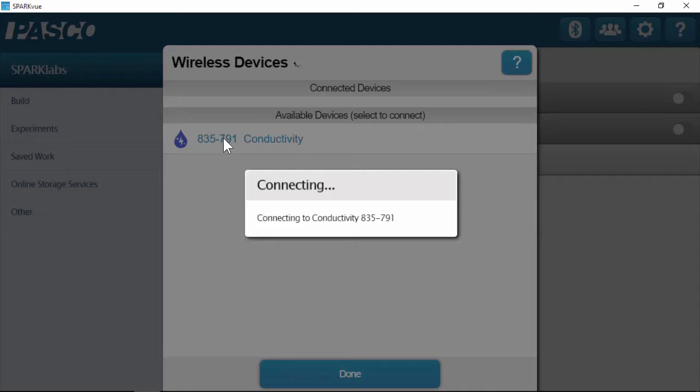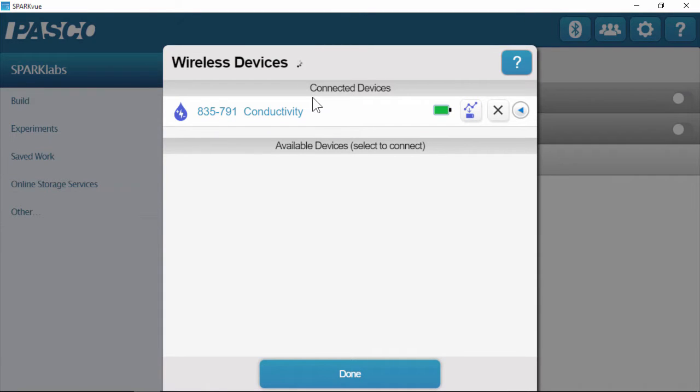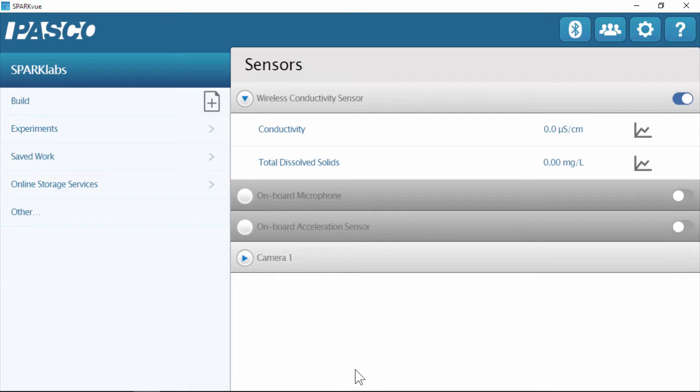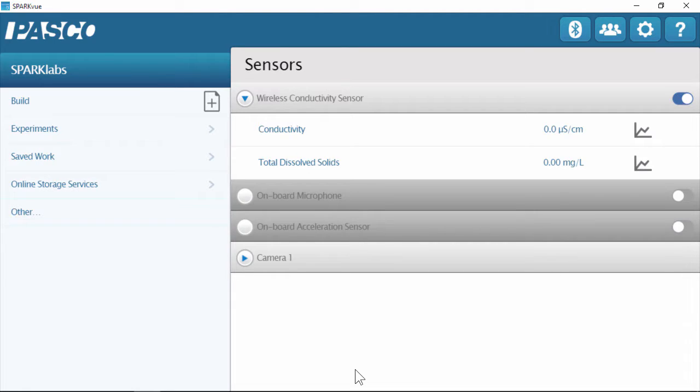I'm going to touch on conductivity, and now it is in the connected devices section of the screen. The Bluetooth light is now flashing green, indicating the sensor is connected. I can see the sensor measurements pop up on the home screen. This conductivity sensor can measure conductivity in microsiemens per centimeter. It also measures total dissolved solids, or TDS, in milligrams per liter — great for water quality. And it has built-in temperature compensation in the probe, so you can do water quality samples without worrying about temperature fluctuations affecting your measurements.